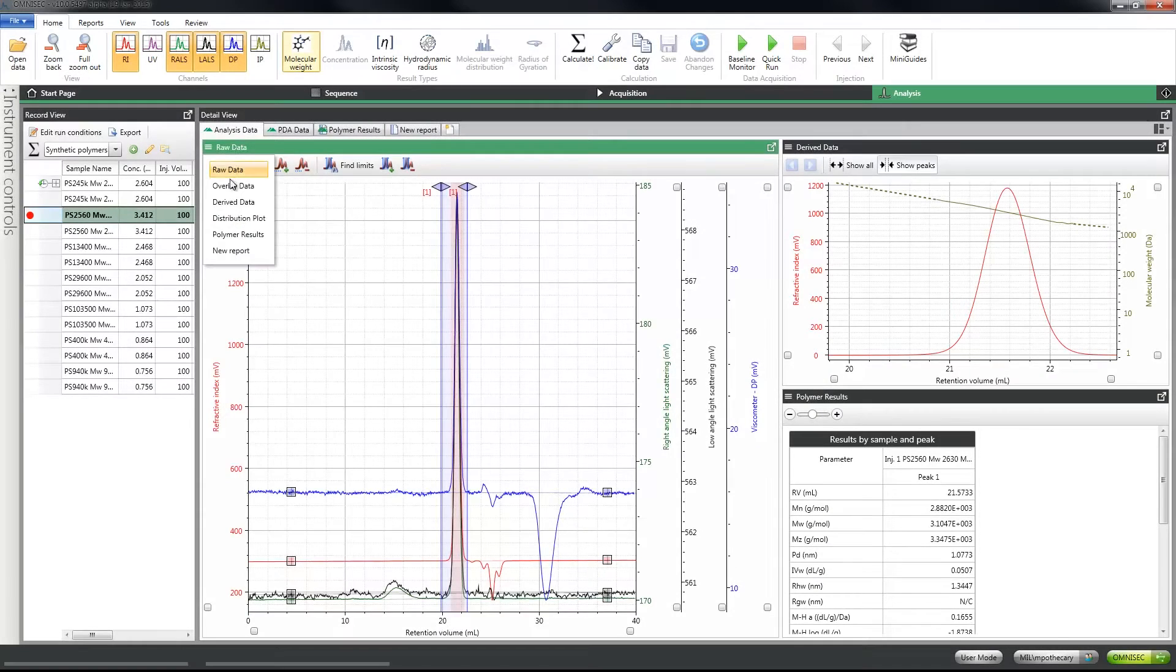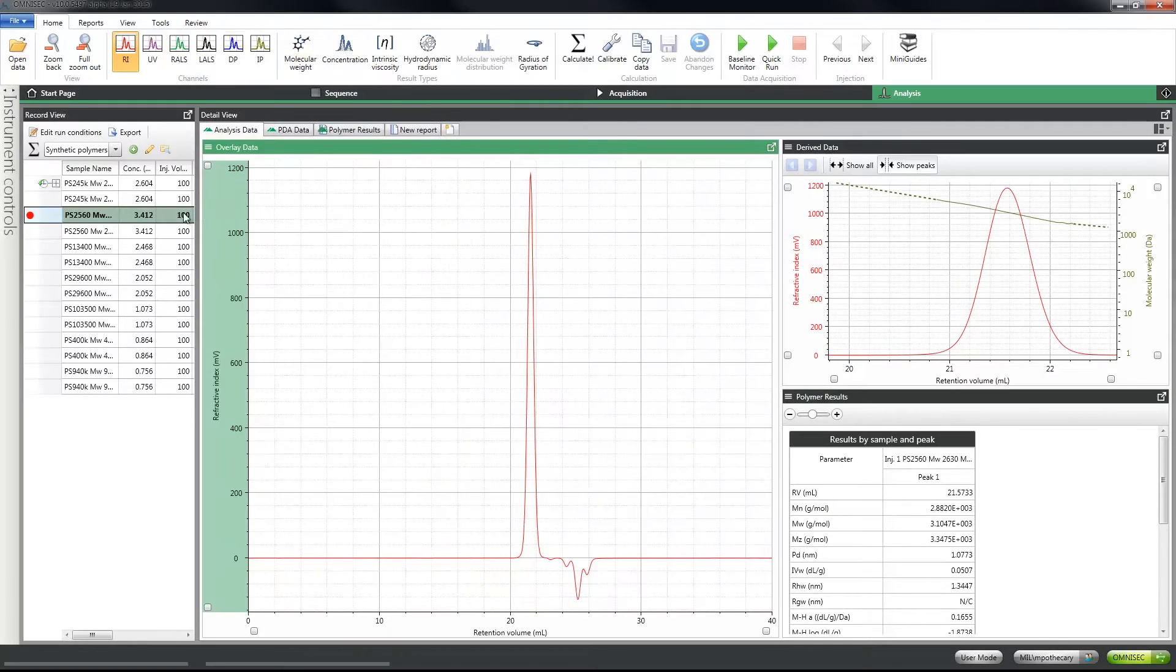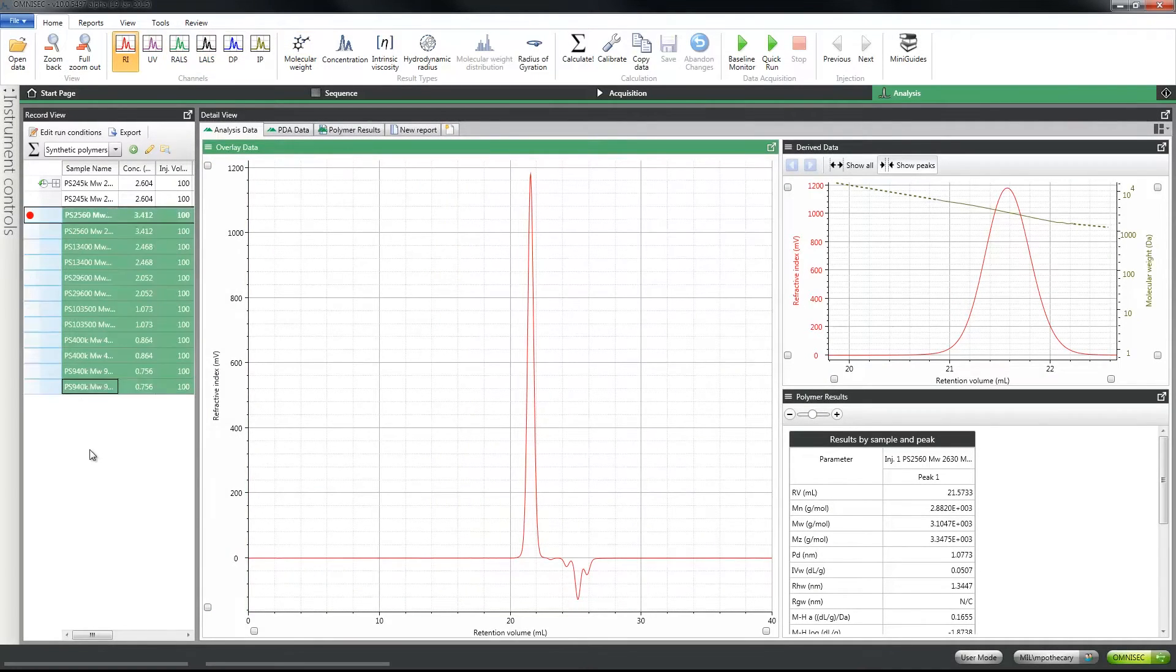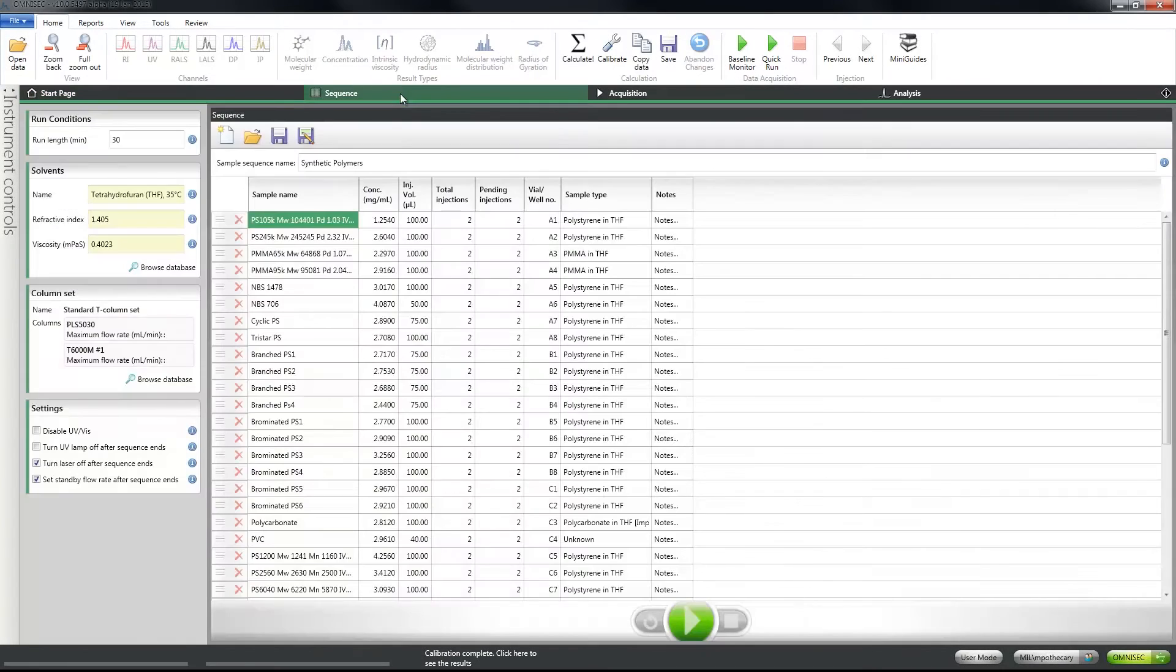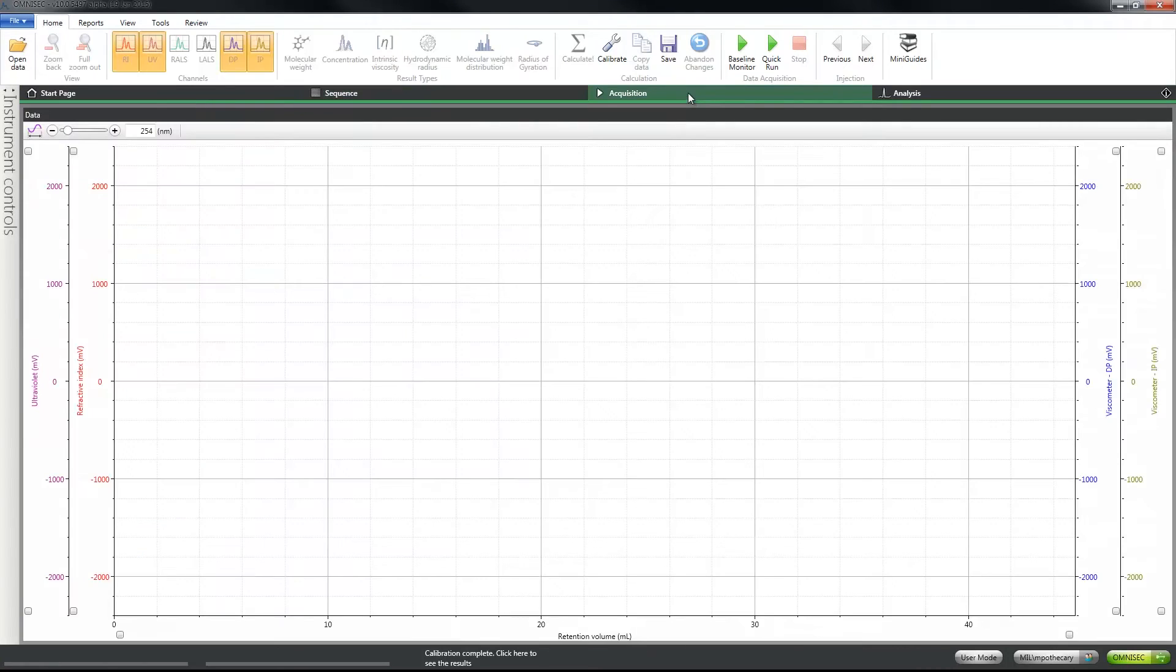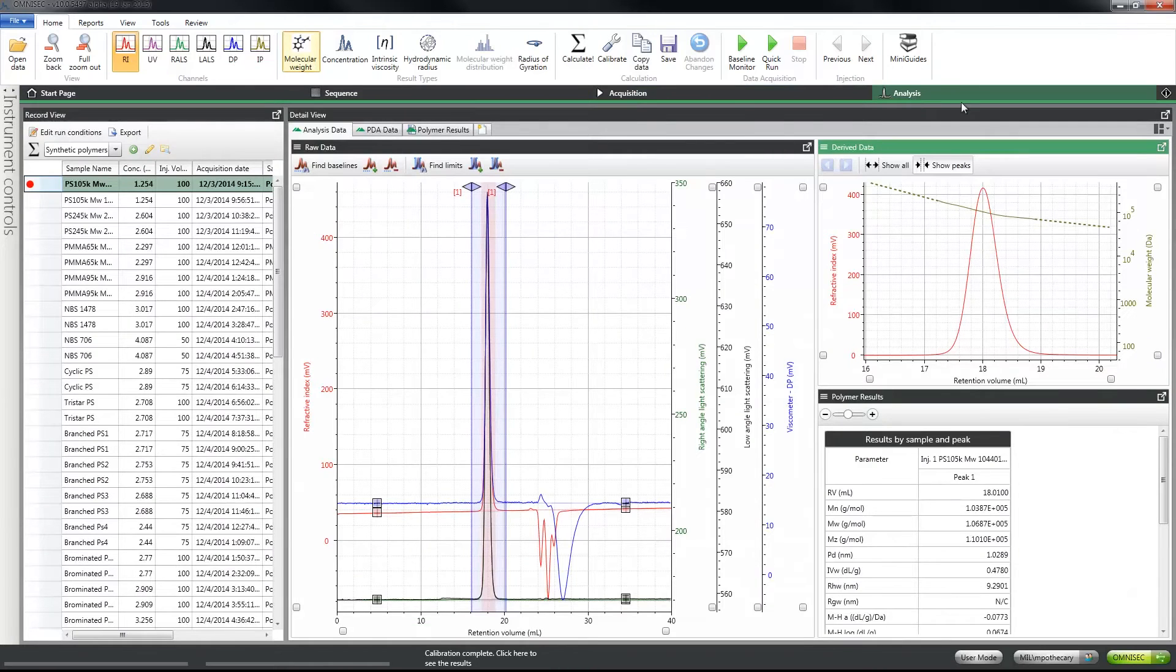So how did we improve our market-leading multi-detector GPC software even further? By building a completely new version to control the entire system from data acquisition through to analysis and reporting using a simple workflow-based design.